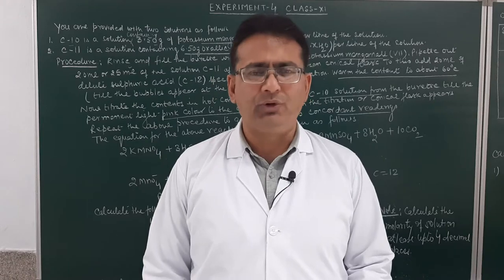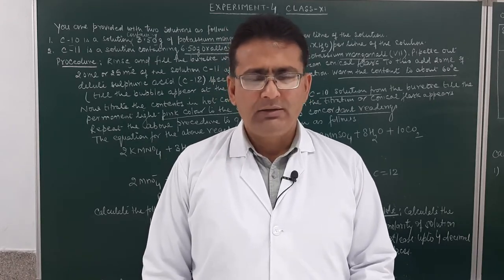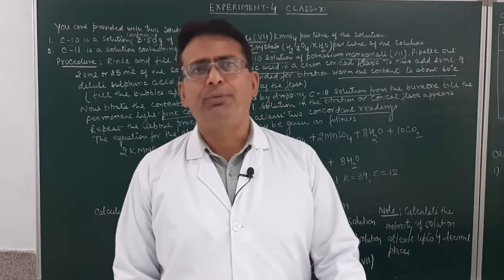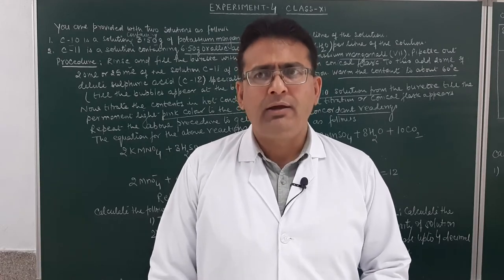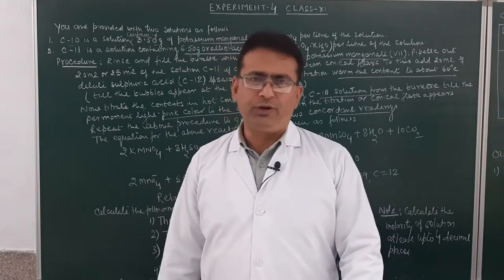Today in this practical demonstration, we'll be doing experiment number 4. This is again the titration of KMnO4 versus oxalic acid. The procedure will be the same as in experiment 3, but the calculations are different. What is the procedure for this?